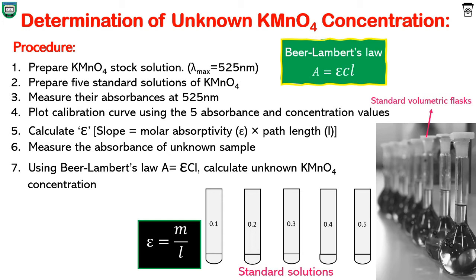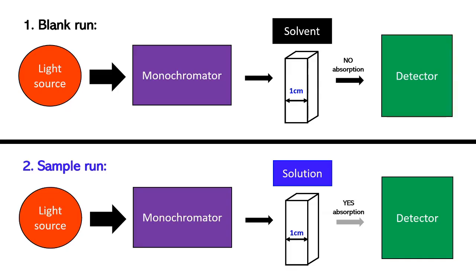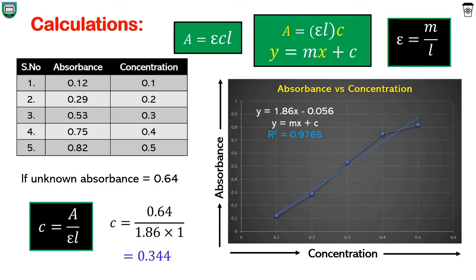Before jumping into the experiment, first take a clean cuvette, fill it with DI water, and run the experiment at 525 nanometers. This is called a blank run. A blank run is when light passes through only the solvent in the cuvette. It is important to record a blank to make sure no light is absorbed by the solvent and the cuvette. Blank spectra are used to subtract background noise from the sample spectra and are recorded once for an entire experiment. It's good to record a blank every 6 hours.